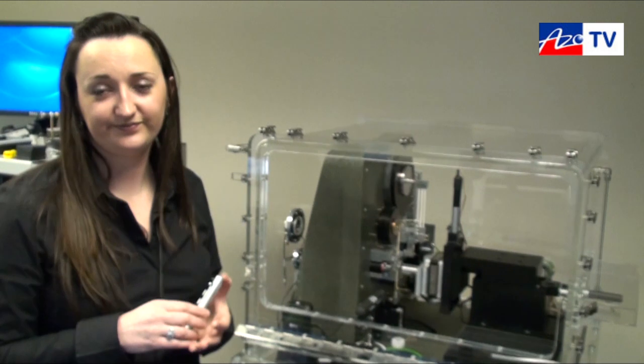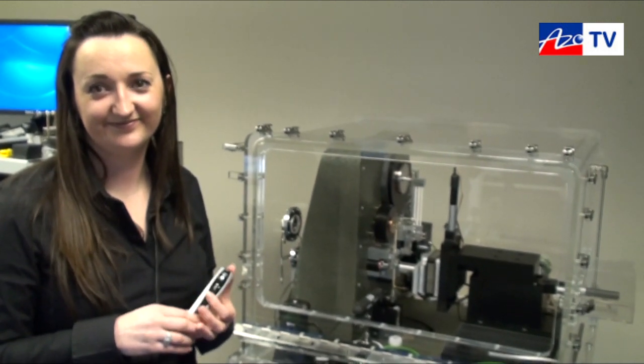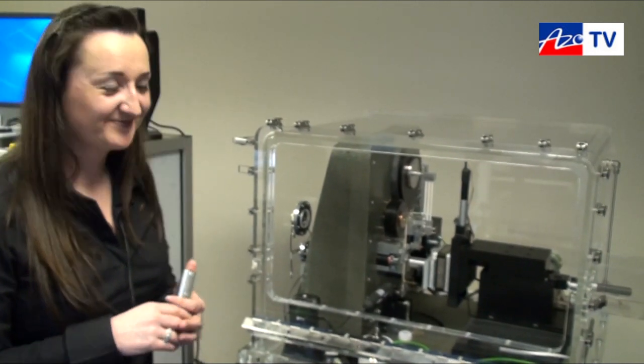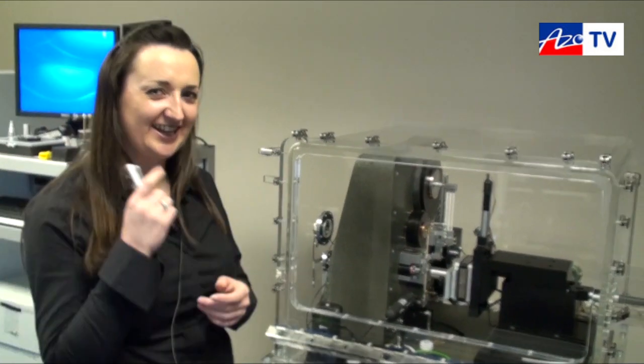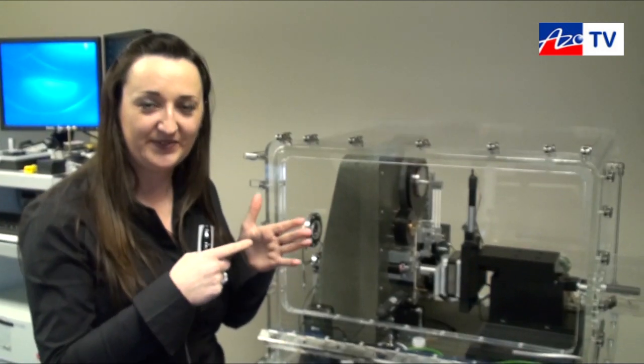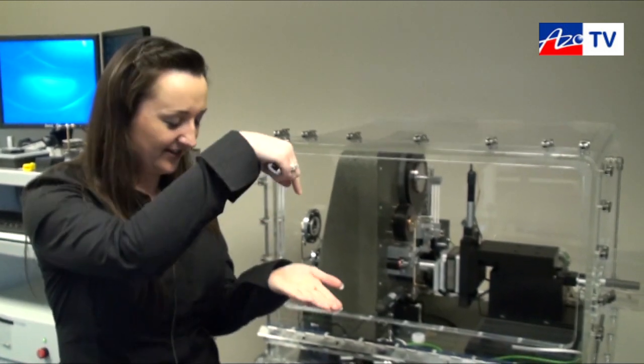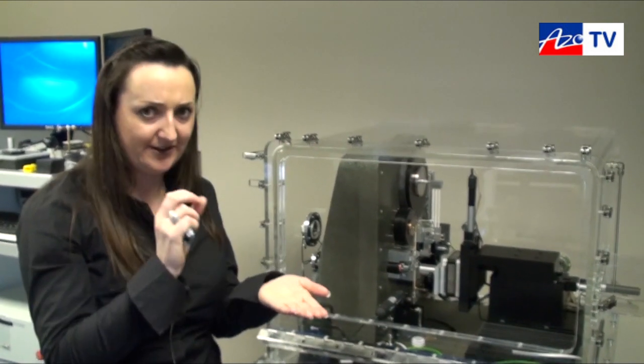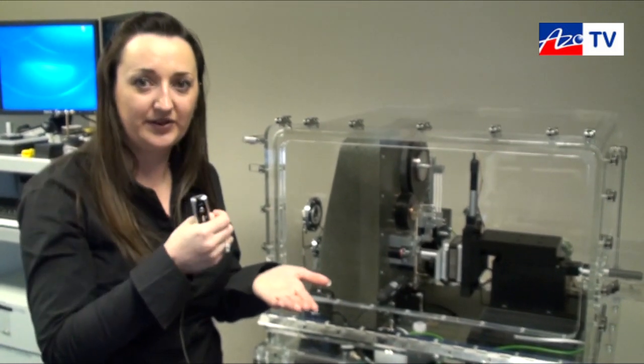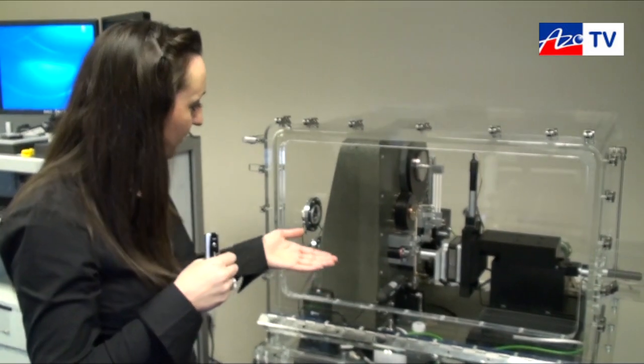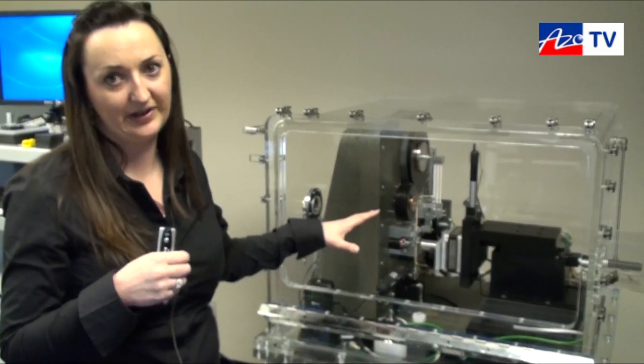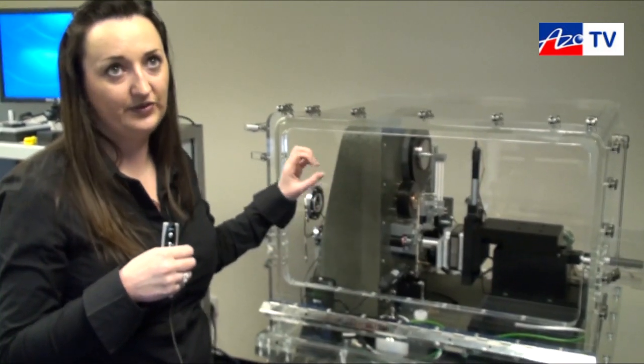Okay, and what advantage does it have for users to be able to do it at these elevated temperatures compared to other instruments that can only work at ambient temperatures? Well anybody who looks at our instrument always thinks it's a little bit strange, a little bit different. We indent on the horizontal plane. Every other instrument available indents like this which makes it very difficult to do high temperature measurements because the temperature, the convection currents will, you know, they're more difficult to control. Whereas when we're working on this horizontal plane, it's much easier to achieve stability.